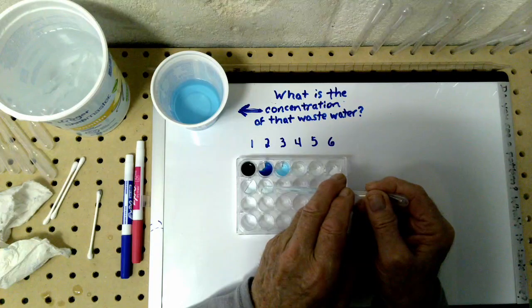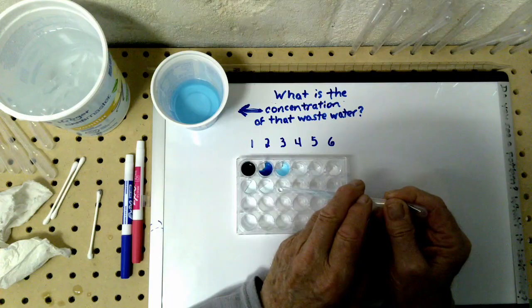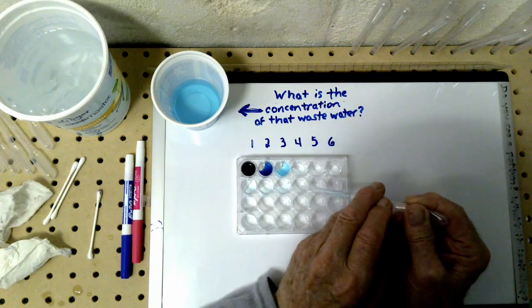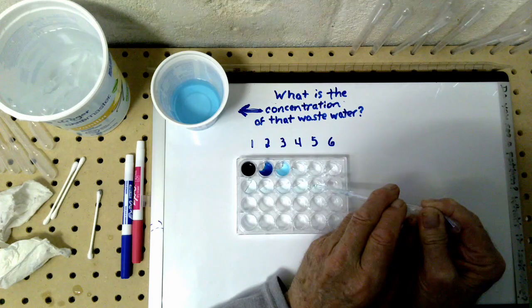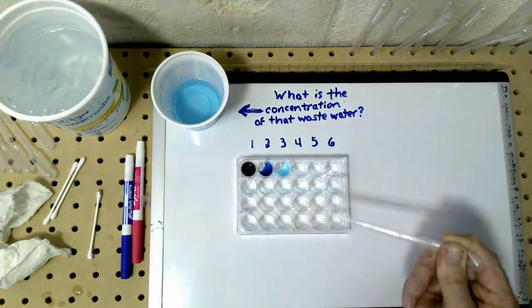You got to take the same amount as these things we're comparing it to. 10 drops each. So I should have all that.